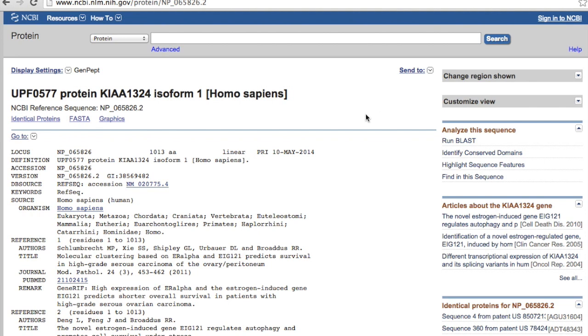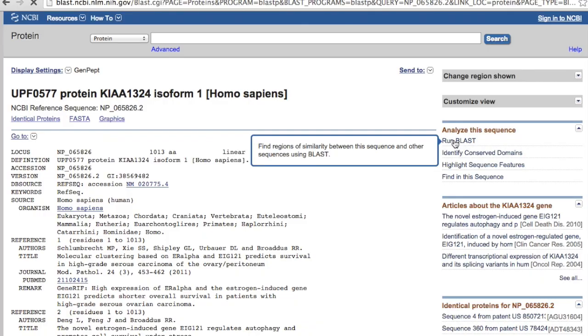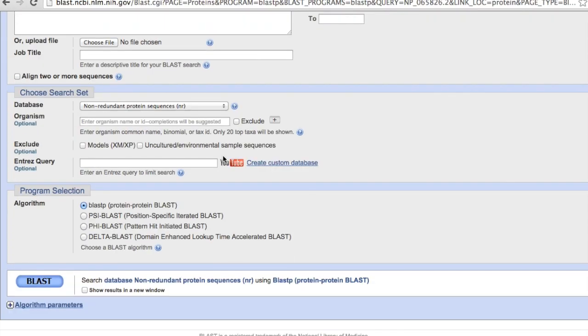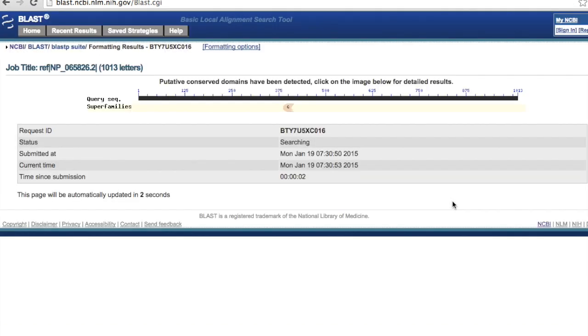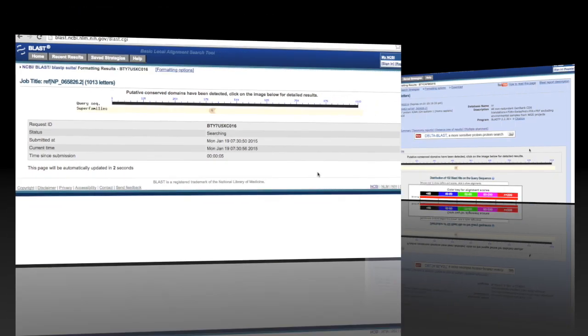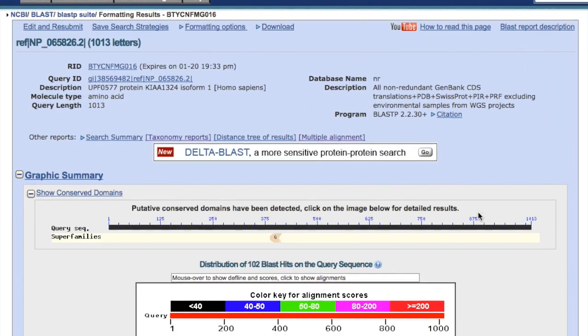So what we will do now is to run BLAST and just click BLAST. And here is the BLAST result.